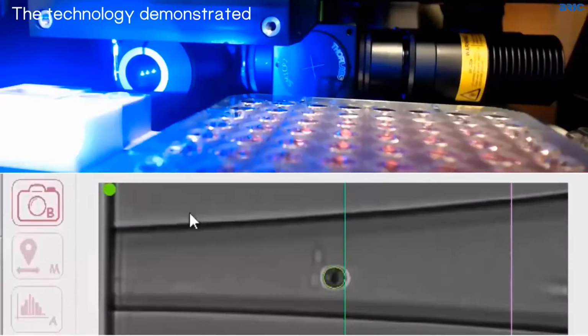Now, in real, I now have a video that is going to show you what is happening inside the device. So here I have the dispenser, my camera. Here we are isolating HeLa cells into a 96 well plate, and at the bottom is what's happening in the software. So what you have to consider is that the image of the dispenser has been tilted 90 degrees clockwise.